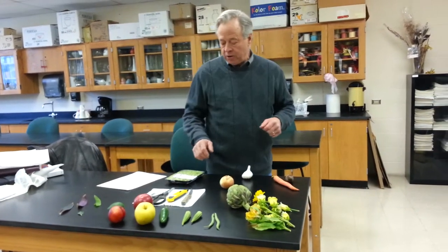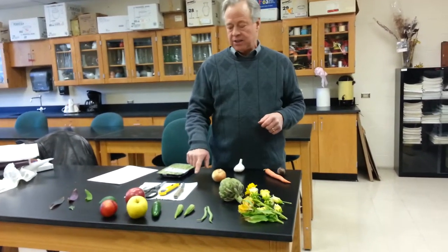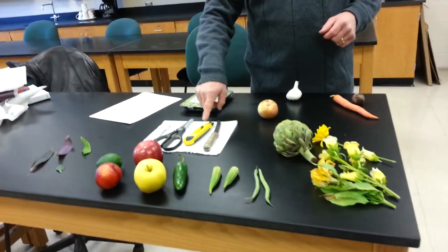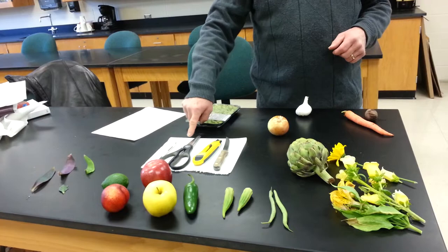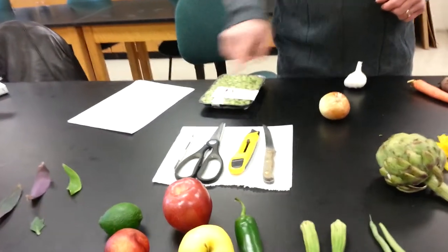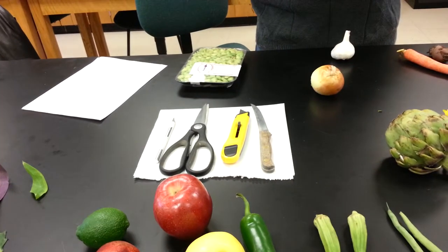What I'd like to do very quickly is talk about the dissecting tools here. I have a sharp kitchen steak knife, a box cutter knife, kitchen scissors, and a scalpel. The scalpel is much too small for the job, but the box cutter is the perfect dissecting tool.